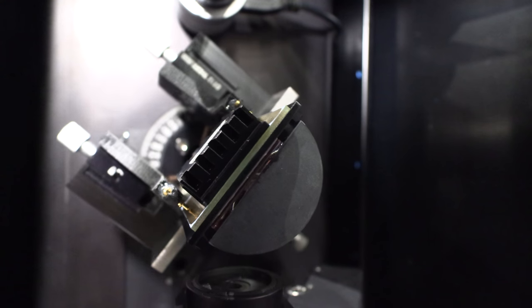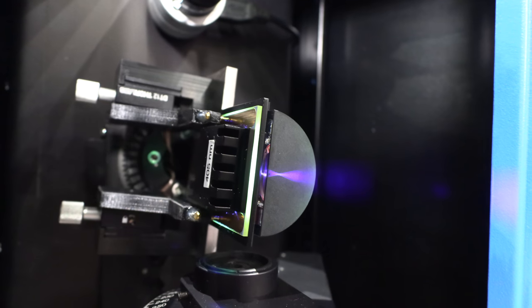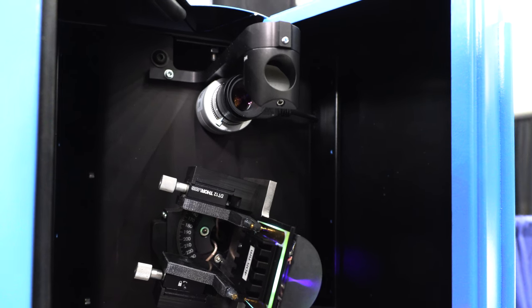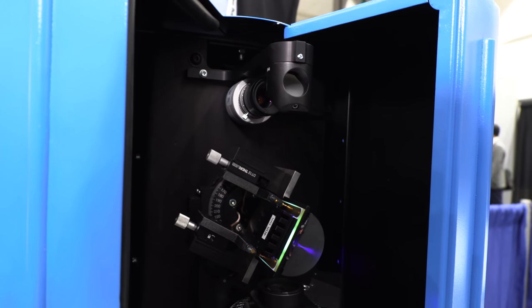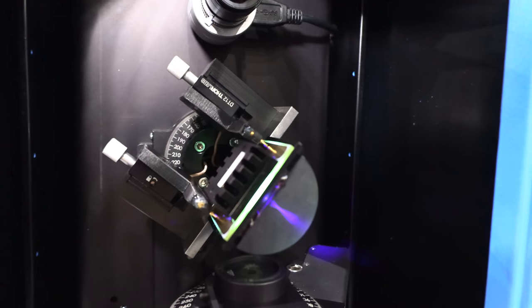Now the TRACER instrument will measure the angular dependence of OLED emitter film where we excite with blue light and the green is the photoluminescence that is measured versus viewing angle.